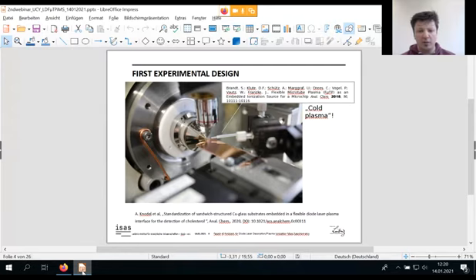Another point which is highlighted here is the flexible microtube plasma. You have seen this plasma in some previous presentations. The very cool thing about it is its geometry. It can be compared to inverse low temperature plasmas, but without a grounded electrode. So you have this pin electrode inside a glass capillary. This is put on high voltage, but without any grounded electrode, which is quite cool, because it has some benefits in ion guidance, because it creates an electric field to the MS inlet.